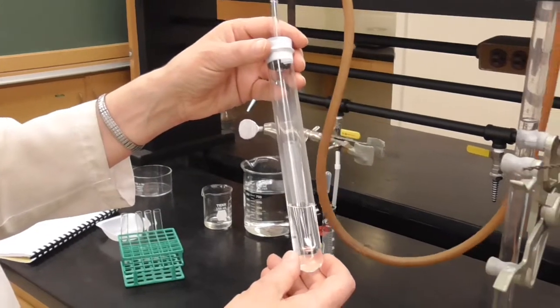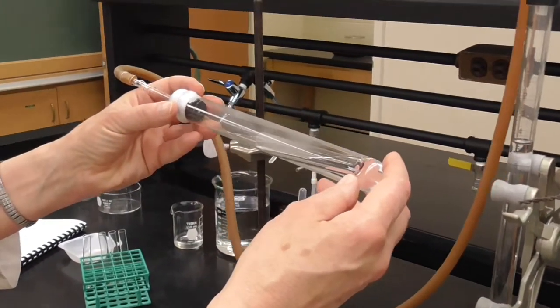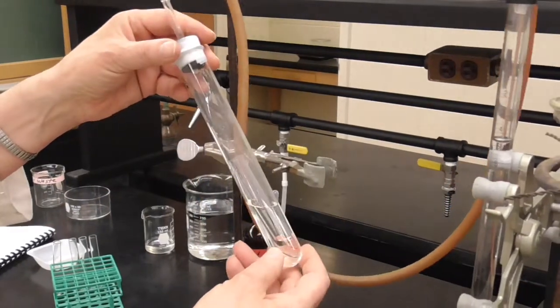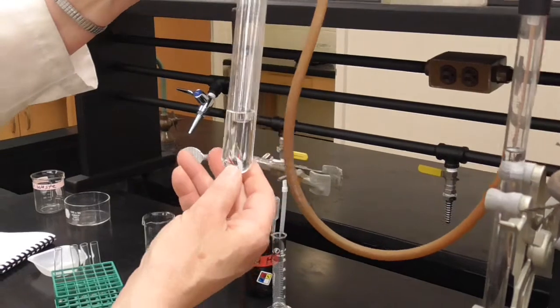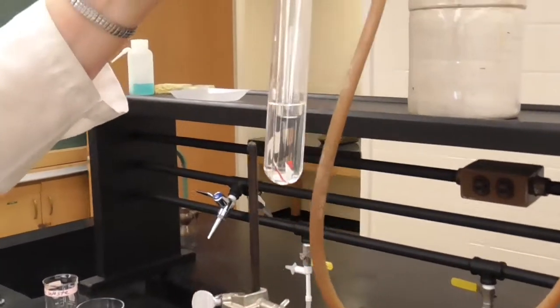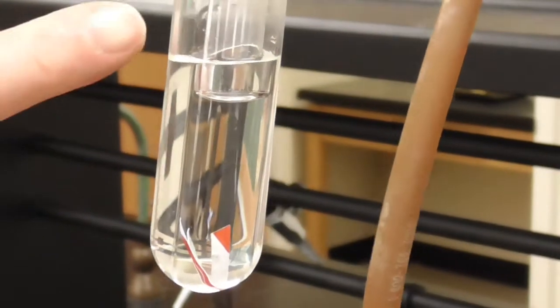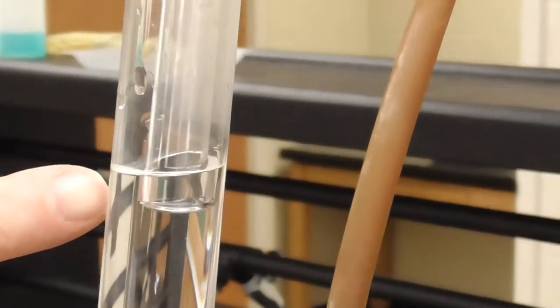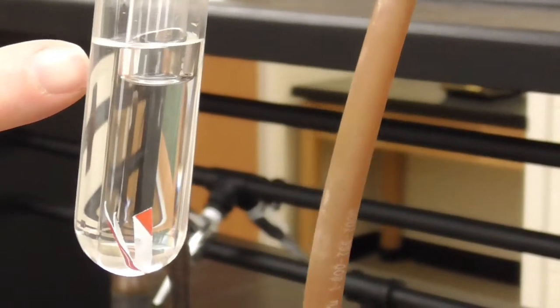So we are ready to start the reaction, and I'm going to do that by just tilting the test tube and then tilting it backwards to try and get that hydrochloric acid into the small test tube. I know it's a little bit of an optical illusion, but you see a meniscus here and a meniscus there. So I do have hydrochloric acid inside of the smaller test tube.